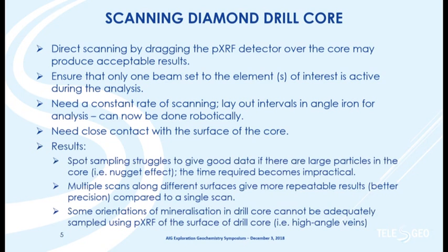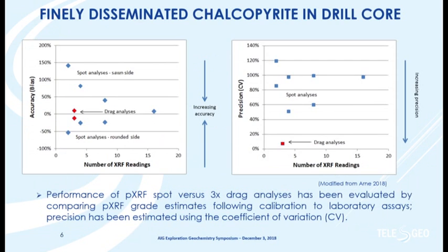Looking at drill core from a number of porphyry copper deposits in North America, spot sampling really struggled to get representative data when compared to four-acid copper assays. Doing multiple scans with the instrument dragged across the core, we were able to get fairly accurate and reproducible results. We also had situations with high-angle veins in the core that we simply couldn't analyze using the XRF — you have to remember that with XRF you're only analyzing the surface of the drill core.